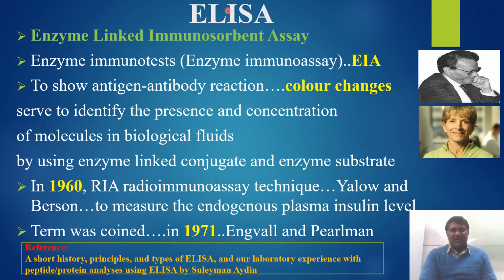So I would like to tell you about the ELISA. It is an abbreviation of enzyme linked immunosorbent assay, and it is also called the enzyme immunotest or the enzyme immunoassay. Its short form is EIA, and this is the main principle of ELISA.